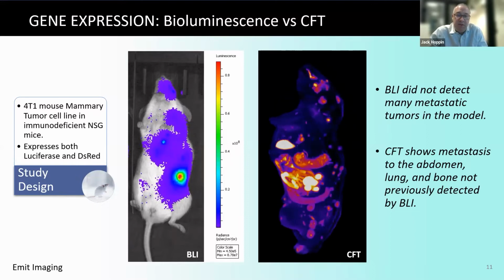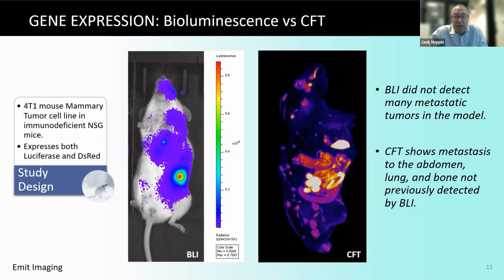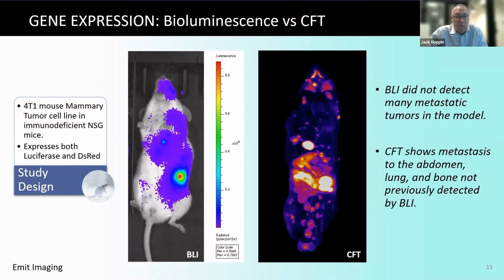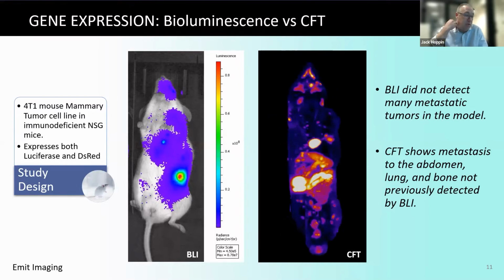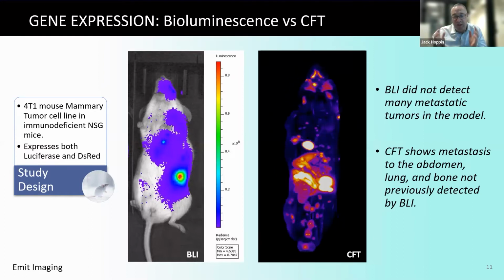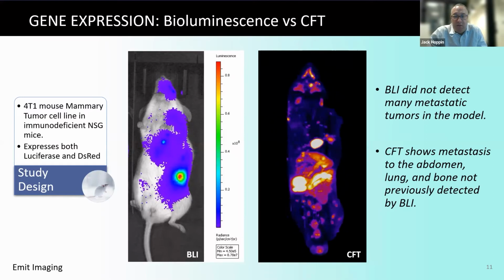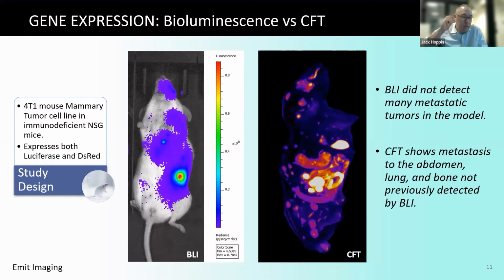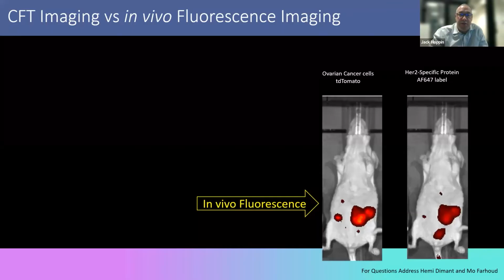But it really has opened up eyes. That's pretty cheesy. It has really kind of shown us a lot of things that we had not seen in these subjects. Very often you would resect, or you might take a section, put something on a microscope, but you're really missing the whole body distribution of what you were trying to study. And I think therein lies the value of the technology.